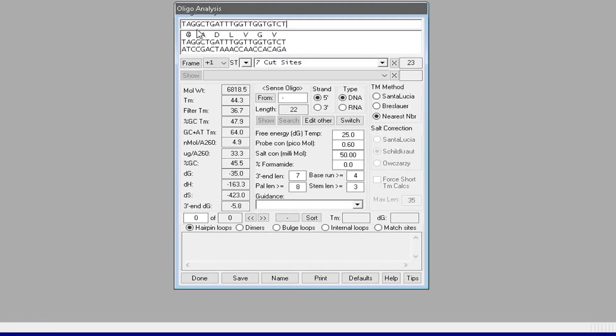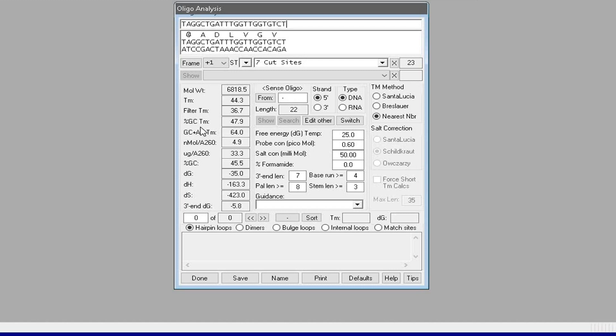The software displays the properties of the oligonucleotide primer sequence like molecular weight, melting temperature, absorbance reading at 260, and the GC percentage.